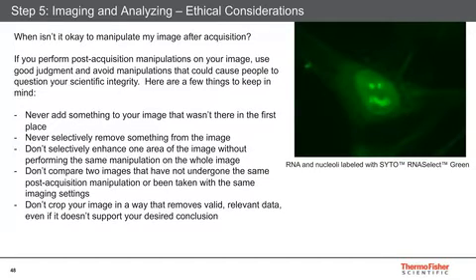All right, let's talk for a minute about ethics. And this is something that's not actually covered that much by other people out there, so I wanted to really make a point of it. When is it okay to adjust your image and when is it not?